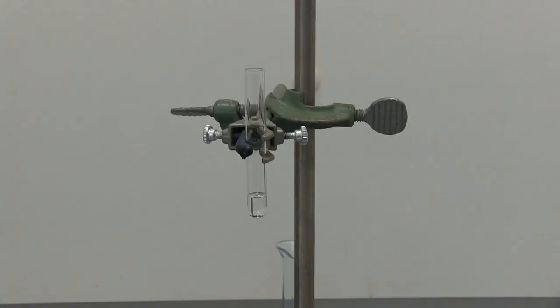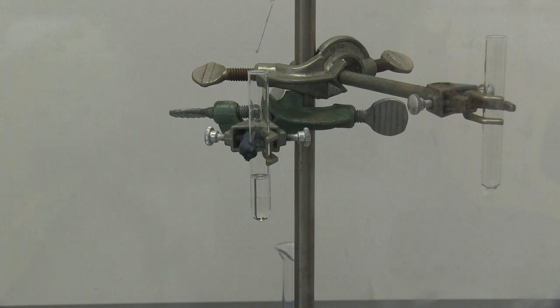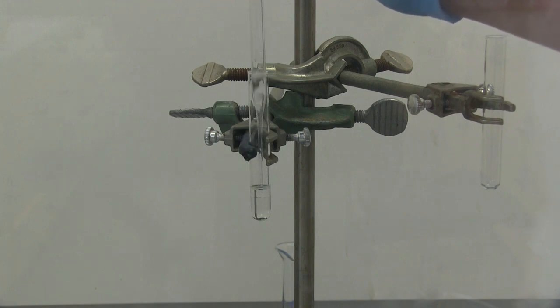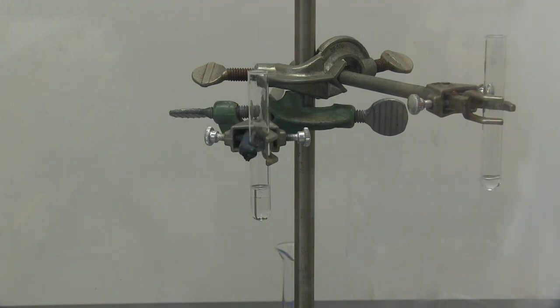Now I have 0.3 milliliters of 3 molar sodium hydroxide. We're going to add that in to neutralize our distillate. I'm going to use this glass pipette to mix up the two layers. Now that our layers have separated, we're going to take off the top layer and transfer it to a new test tube.